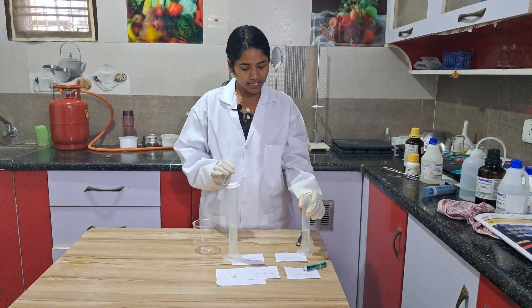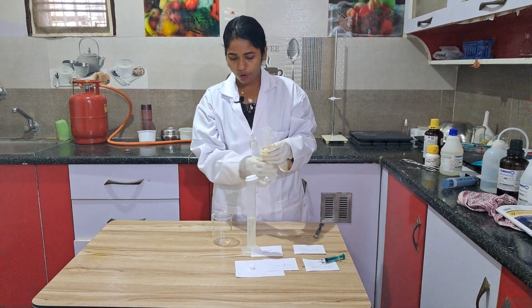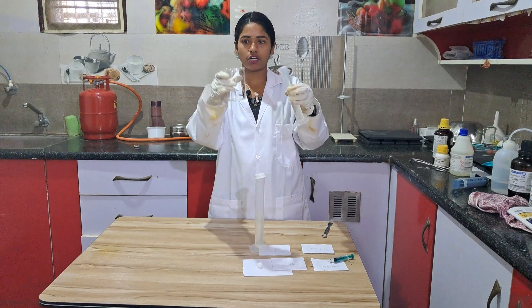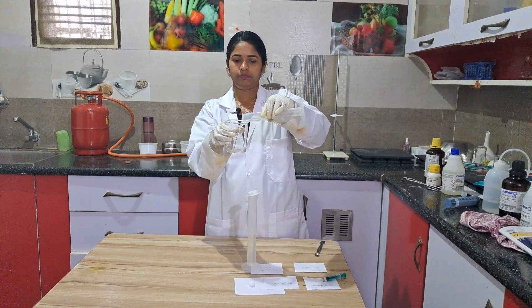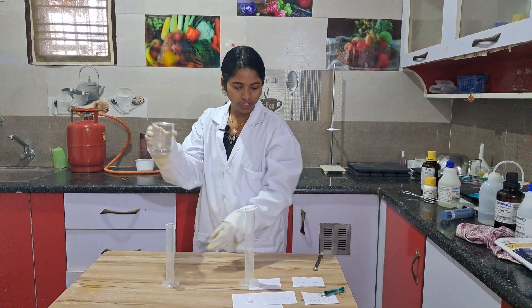What I am going to do now is take 30 ml of water. This is 30 ml of water. I am going to put this 30 ml of water into this beaker. 30 ml of water has been taken.